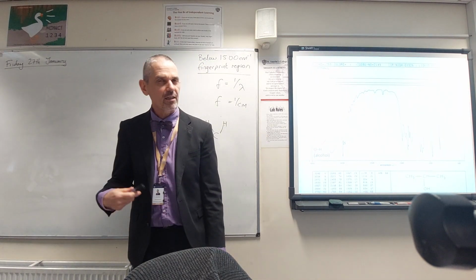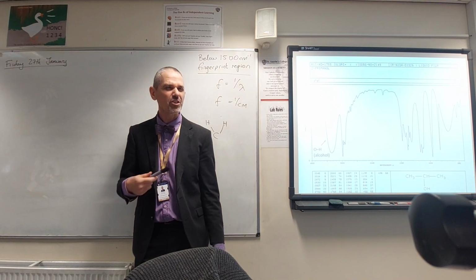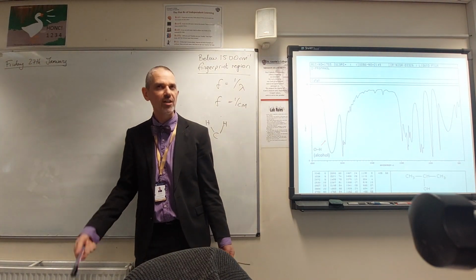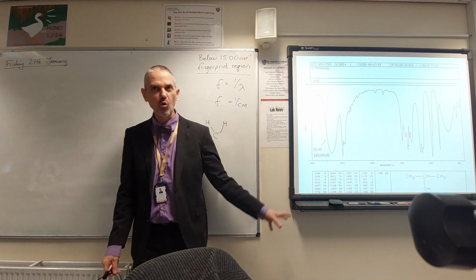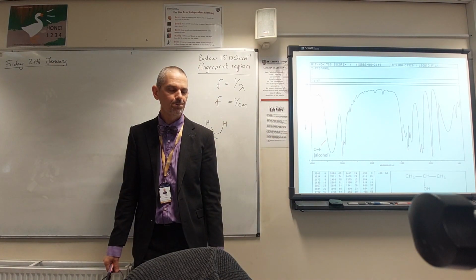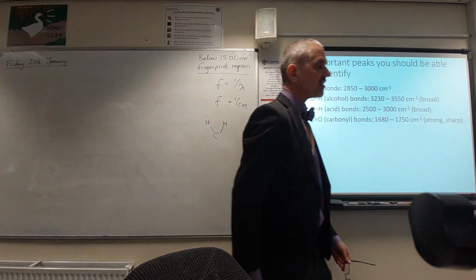So one of the things you need to know for infrared is not just where the peak is, it's also to have a feel for what it will look like. OH is always going to be a massive, wide, broad peak. Okay. Let's look at some others.